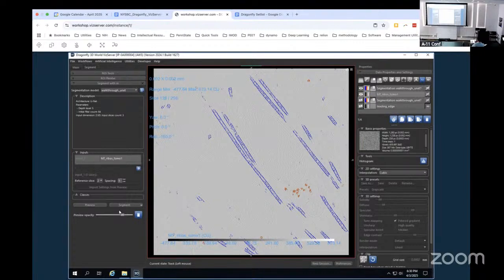So, yeah, so when you retrain, it's basically use only the current data set. Oh. And you train. I've stayed up till like, I stay up till 3 AM every night. So like half of that time is me waiting for things to for train and I'm looking at something. Yes. Wait. If you do it enough, it gets kind of addictive and you like want to see Yeah. what comes out. Oh, this is Yeah. nice. Mine's pretty good. All right.